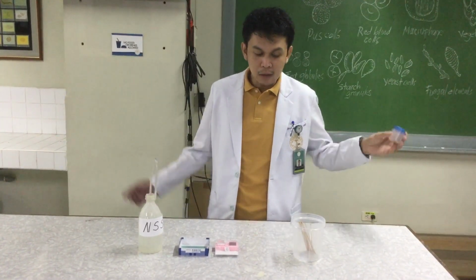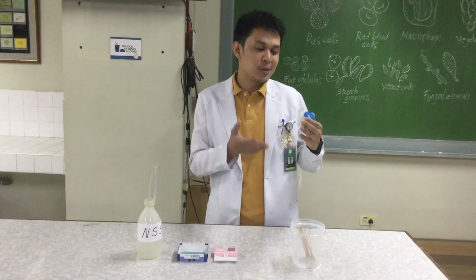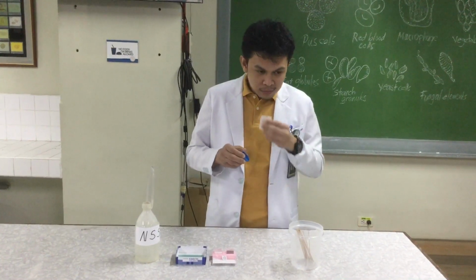Now, how will you know whether the stool is really a stool? Of course, you need to observe it. Observe the form, whether it is watery, formed, semi-formed, or what. You take note of that, and also the color. What else? You can actually open it and smell it if you want.